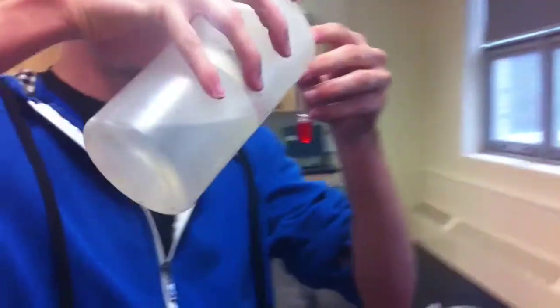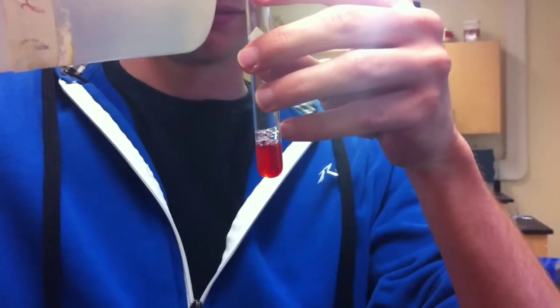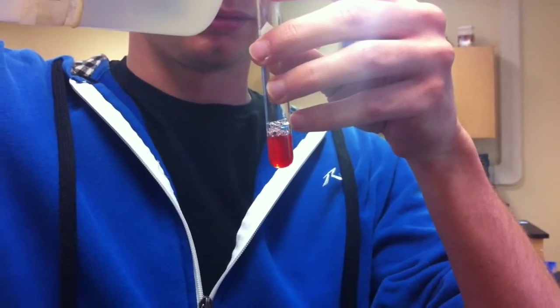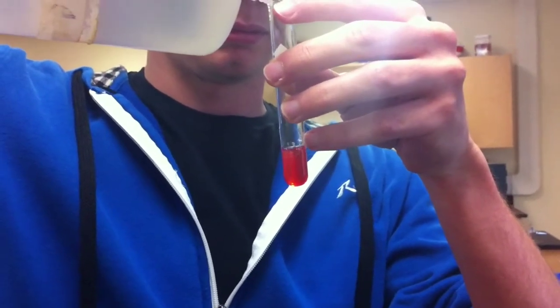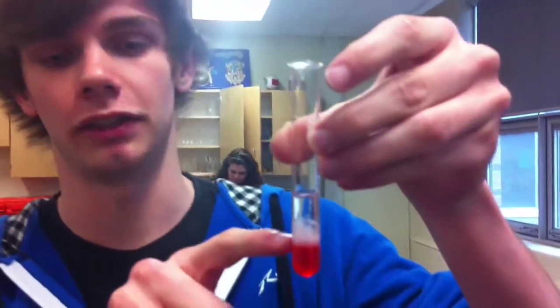Now that we have our two milliliters of solution, we're going to add equal parts of ethanol. The ethanol is precipitating the DNA, and that's this white stuff in the middle right here.